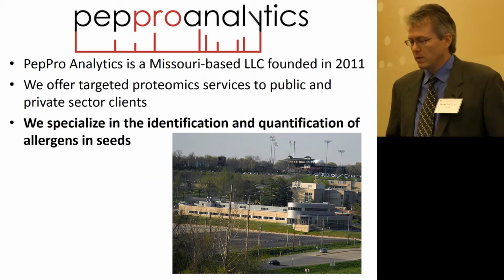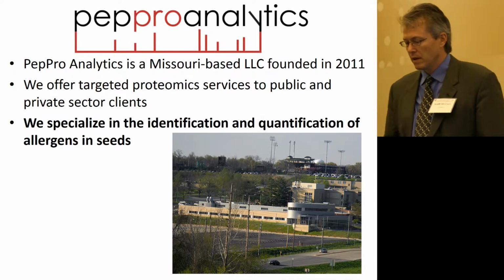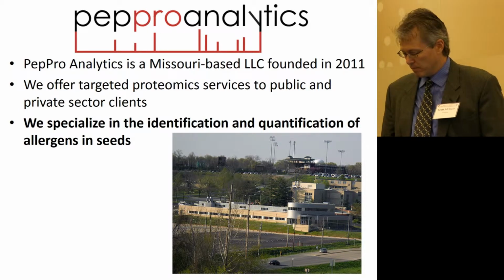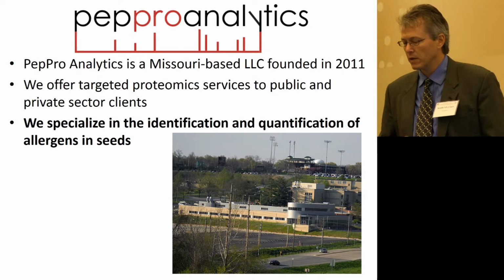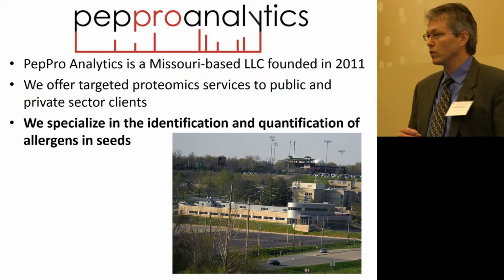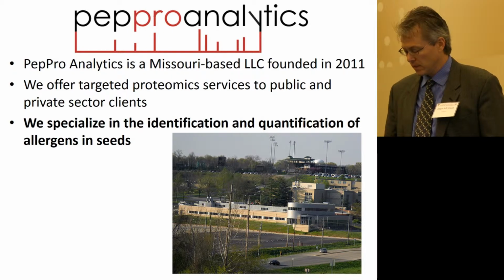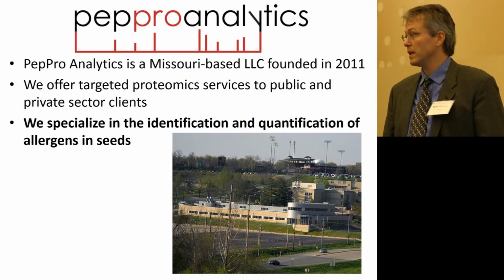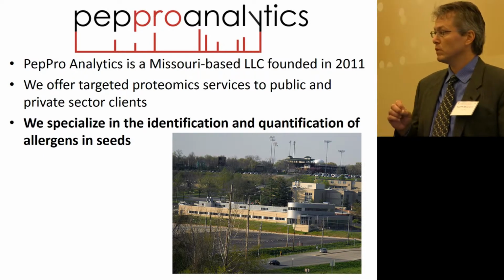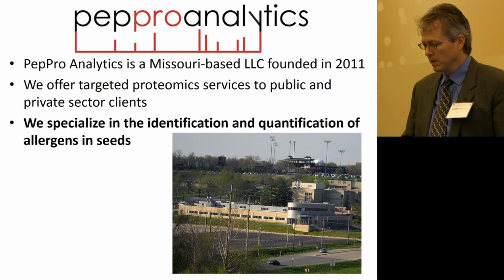And so PepPro is really an outgrowth from Dr. Jay Thelen's lab at the University of Missouri. And so they haven't been around too long, but even before they started this analytical approach with the mass spectrometry, they are really experts in the field of taking a look at seed proteins. So they've got a long history of expertise in doing that in particular. In fact, they've worked a lot with the DIGE and regular electrophoresis technology. In fact, Jay's got a nice, I think it might still be up, website on all the DIGE, really presentation of the data and characterizing proteins throughout the growth of soybean seed.